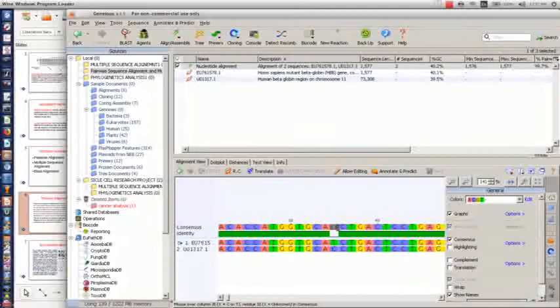But this Y denotes a meaning, which is telling you it's either of these two nucleotide bases that exist here. But how do you deduce this? How do you understand what the nucleotide bases are supposed to be here?